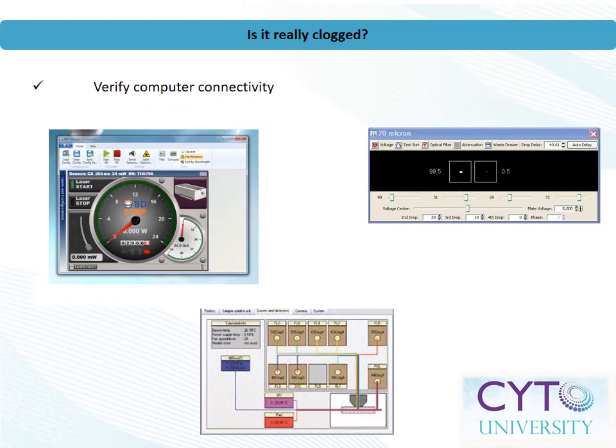Verify that all lasers are on and that the delays are accurate. For open systems, this can be checked visually — always remember to follow proper laser safety procedures. On other systems, there may be software-based indicators, such as the two examples shown here. For multi-laser systems, consider triggering off of other lasers besides the primary laser in order to determine functionality.